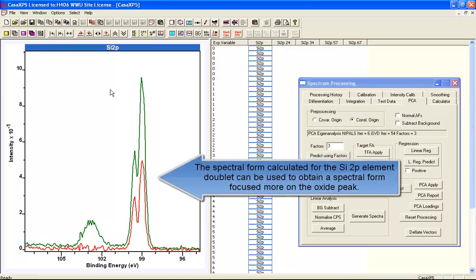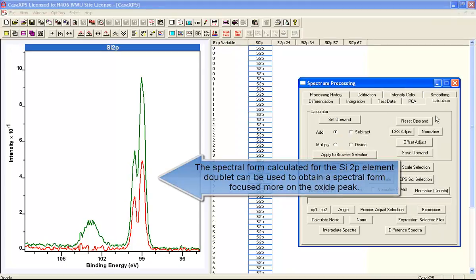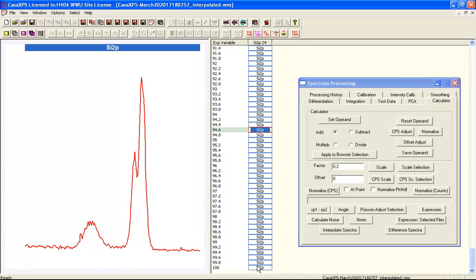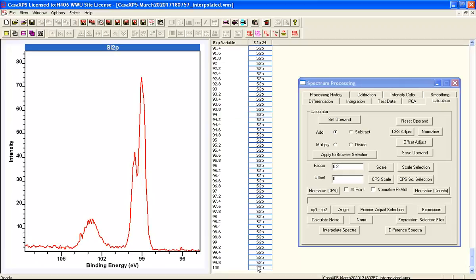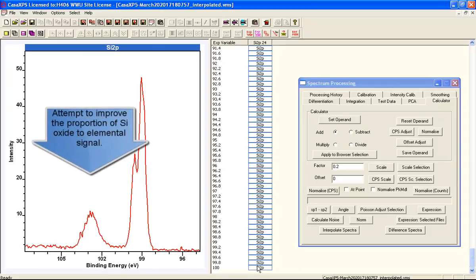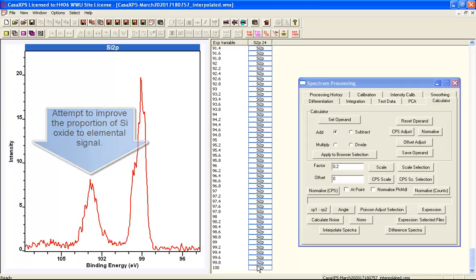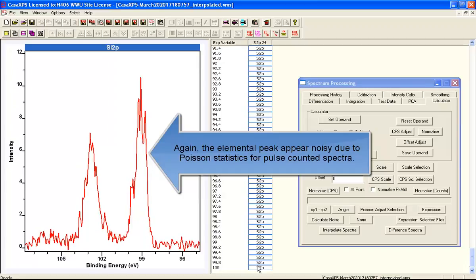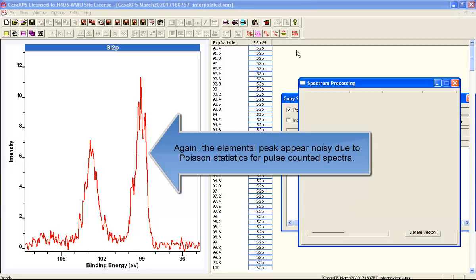Fortunately, we have the elemental peak that we identified first. The spectrum that needs a little more work is the one that's going to be the Si2O3. If we take that spectrum and the elemental peak that was isolated, we can work through a difference list to identify — or rather amplify — the oxide peak compared to the elemental. The idea is to end up with three spectral forms that as vectors have as wide angles between them as possible. Ideally they should be orthogonal, but that's unlikely because we have the elemental peak in all of these data. The idea is to limit the amount of elemental but maintain enough to keep the shapes for the oxides without too much noise.